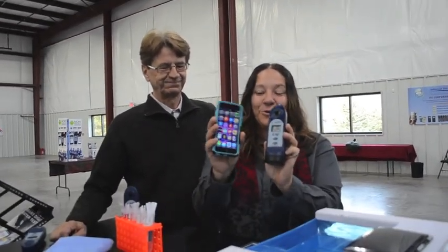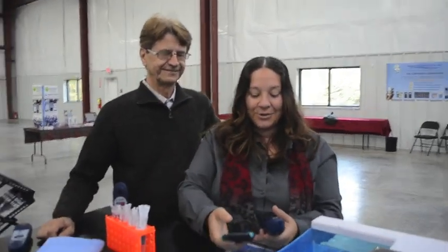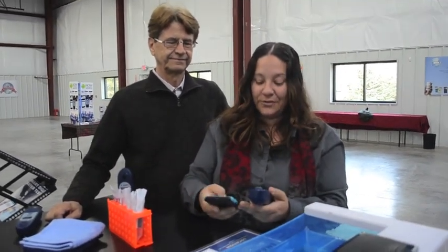We've got the brand new Exact iDip, which communicates two ways with your smart device. We've developed a brand new app that allows you to test water seamlessly. I'm just going to go into our app here and connect via Bluetooth to the photometer.